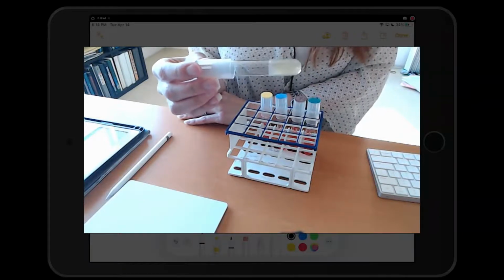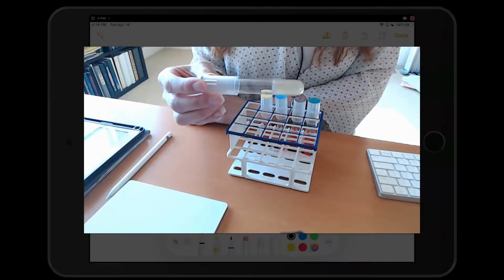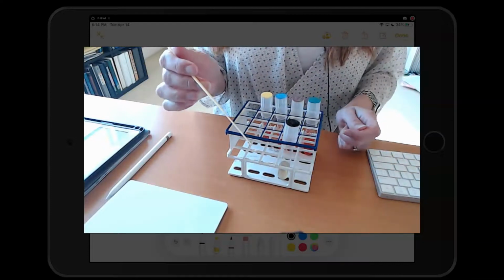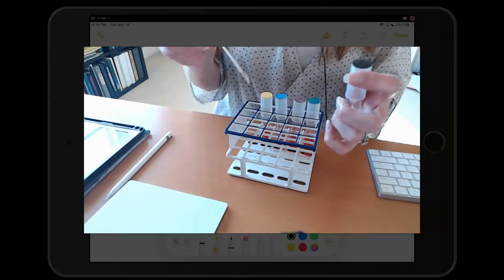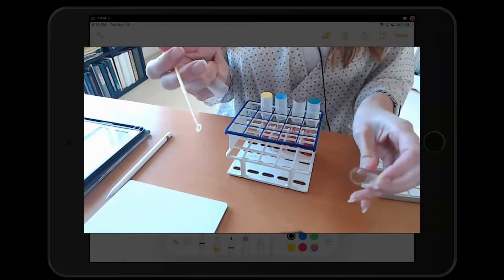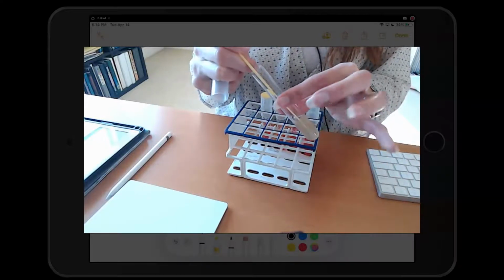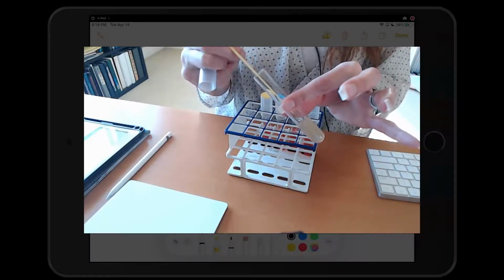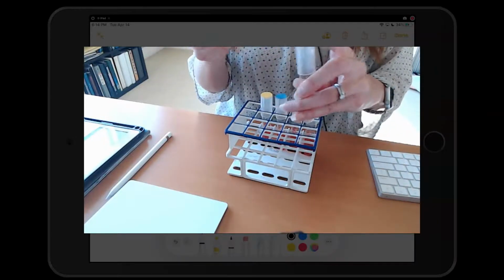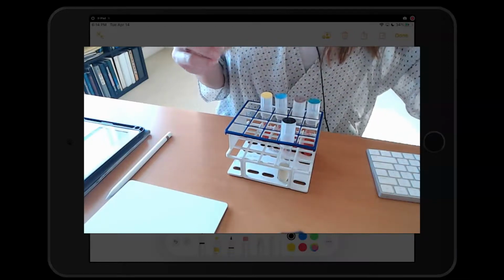So the way we do this is we get a heavy inoculum under sterile conditions, right? We get our culture, we get a heavy inoculum, flame the neck of the test tube, and we actually stab our gelatin 3/4 of the way, flame, cap it, and we incubate it at the unknown's optimum growth temperature, just like we did with the carbohydrates. Incubate them at their optimum growth temperature.